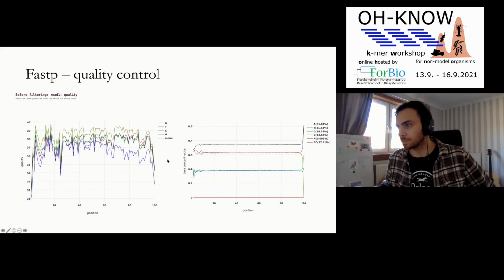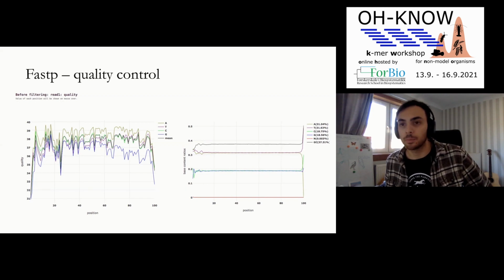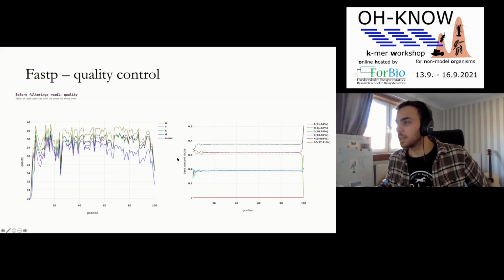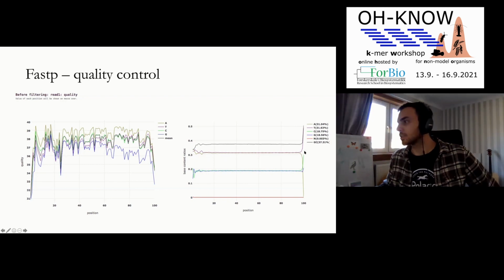It will also show you a graph like this, which shows, along the position of the read, whether you have a bias in the base content. This comes back to what I was saying about this G issue based on the two-channel chemistry from Illumina. If this G issue applies to you, you'll see a massive increase in the number of Gs called at the end of a read. Obviously this difference here is GC bias, which is what causes the two, but at the end, you see they all start going a bit crazy.